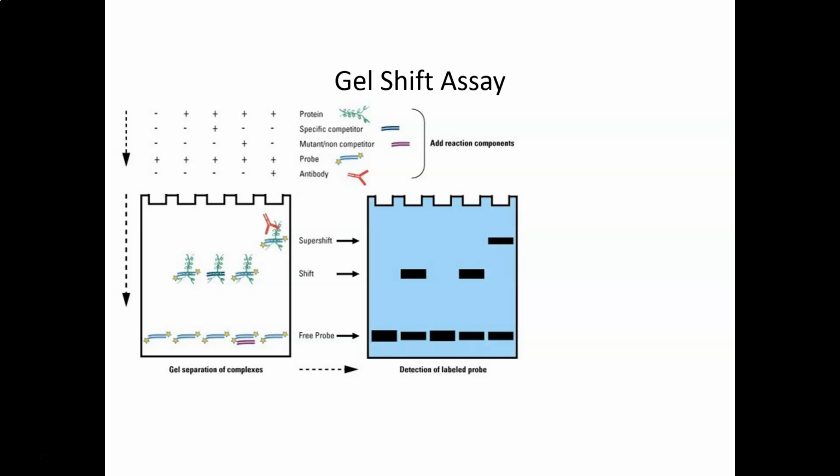It consists of the probe, clearly, because we see a visible band, your protein binding to the probe, and then the antibody binding to your protein. You've almost made this 3-decker sandwich of probe, protein, antibody. And that being an even higher molecular weight structure will give a band even higher in the gel. And now you have shown that your protein binds to this probe sequence with specificity.